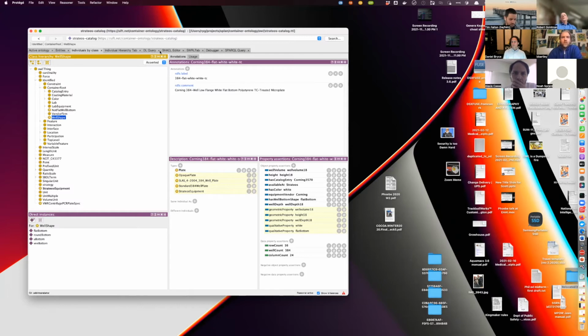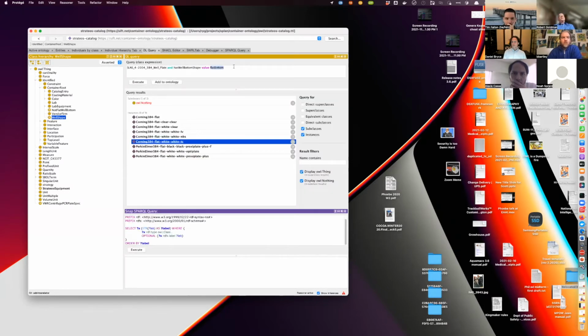Because you could easily say, let's see, this thing does not. I'm going to try this, but I might easily get this wrong. So one could imagine that you really have something like this. It has to have it, where the vendor is Corning and so forth. Yeah.